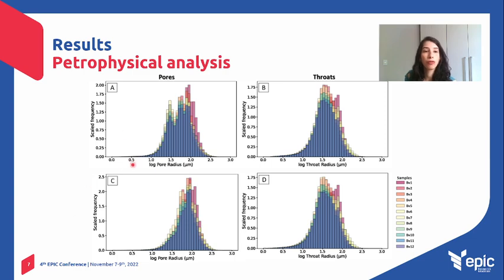When we look at the first picture here, related to all pores in the sample, we can notice a bimodal distribution with a peak frequency of smaller pores. When we compare total and effective pores, the two distributions suggest that effective porosity is dominated by larger pores because we observe a great decrease in peak frequency of smaller pores, now showing a unimodal distribution.